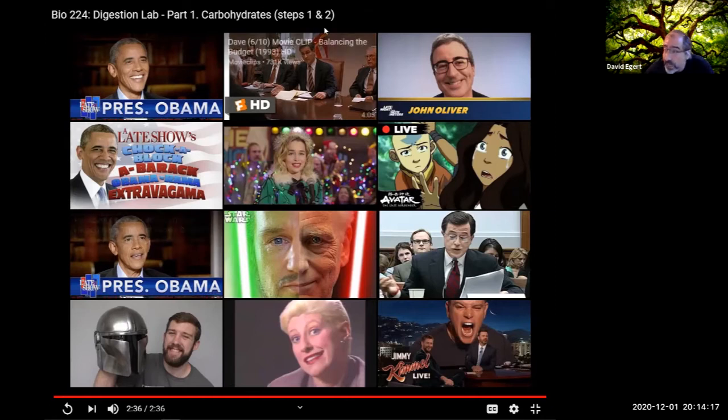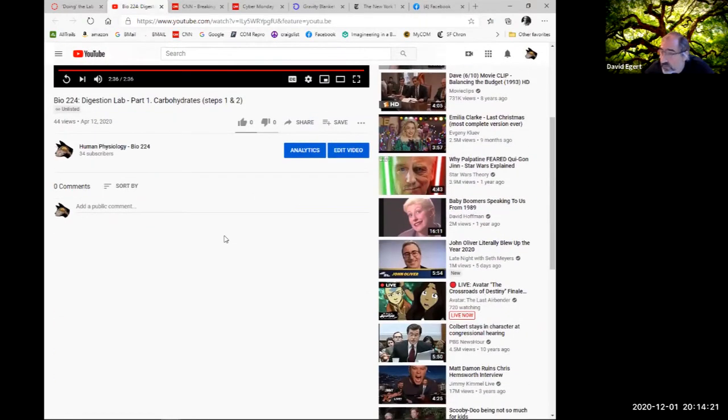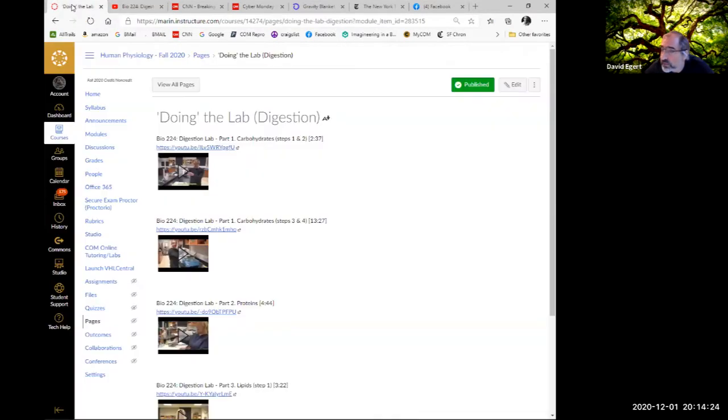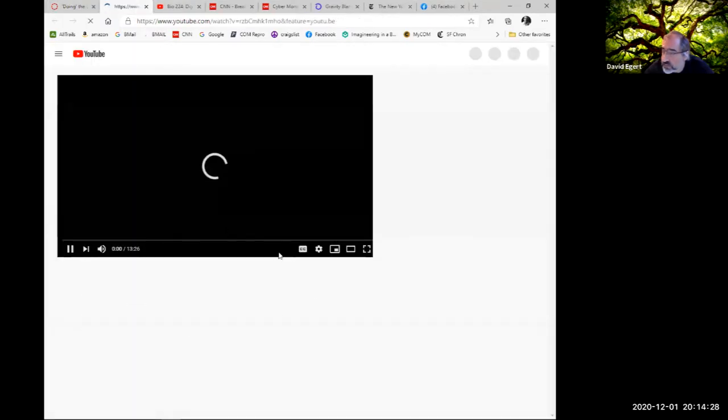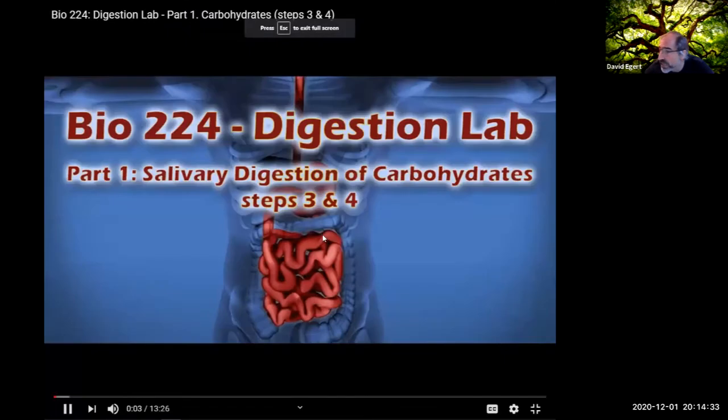So that is part of it. Let's go back to this. This next part is going to be looking at the stuff that we've done. I'm going to speed through this so you can see kind of how it goes, but again, I am aware that we're running on time, so I'm going to speed up and get to the real payoff parts of it.